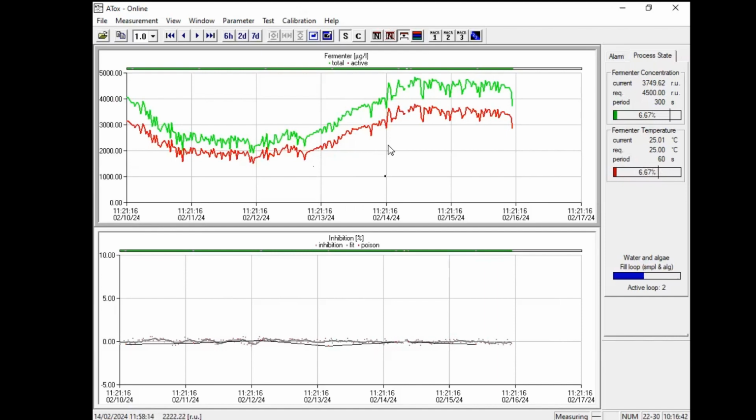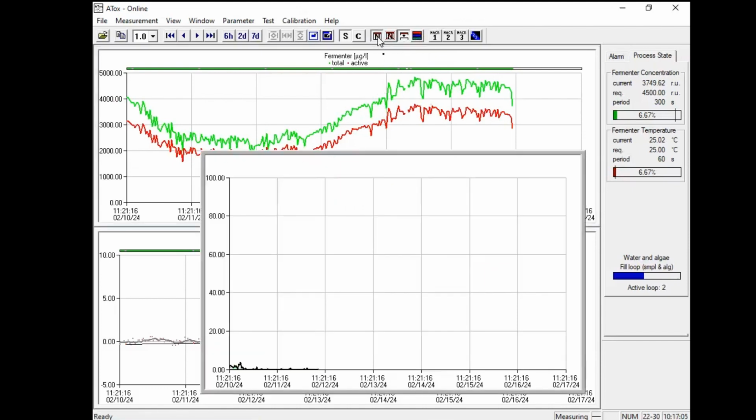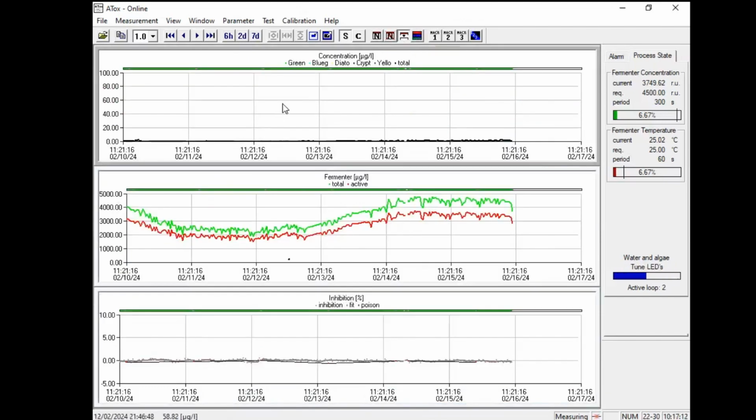So those are the parameters, the measured data over time in the graphs here. The arrangement of the graph can be altered. There may be more graphs. I add now one graph with a new window. You see there's a new graph. I say tile windows, arrange it. So now I have 3 different graphs.